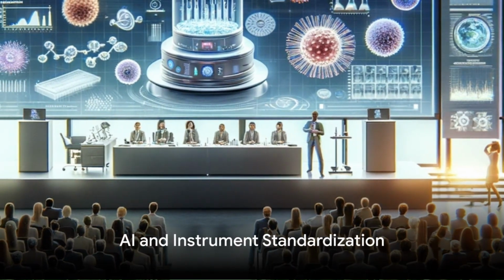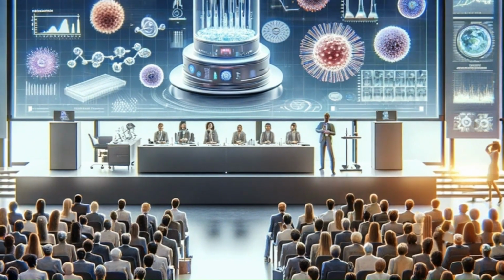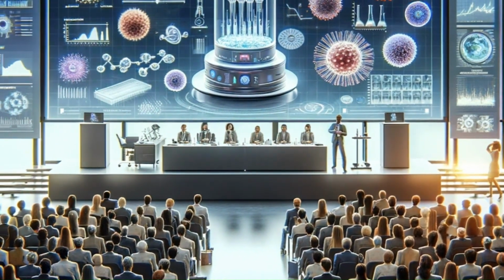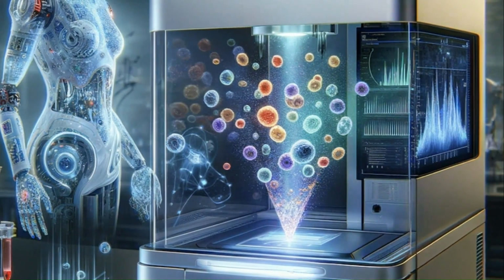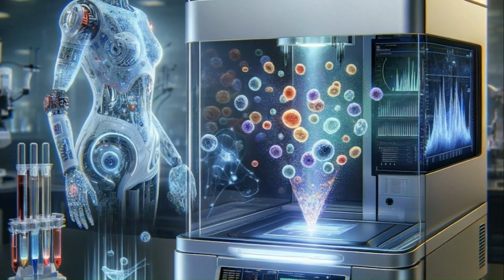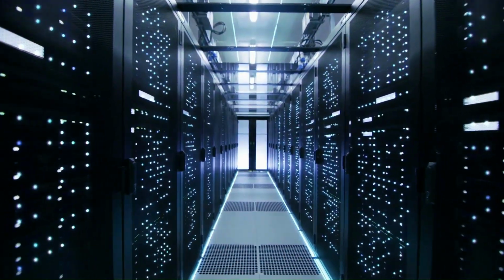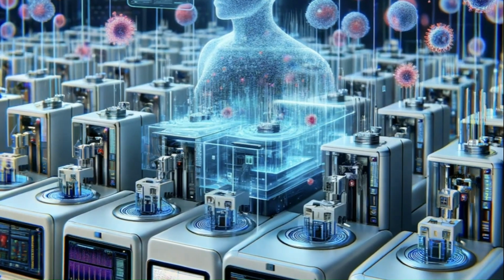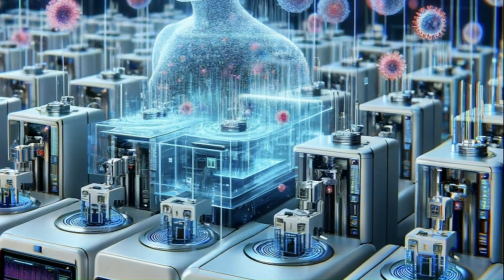Welcome innovators, scientists, and single-cell enthusiasts. Today we're going to explore the topic of instrument standardization from the perspective of artificial intelligence. AI has fantastic potential to provide and, at the same time, gain new insights from good quality single-cell data. Indeed, good AI requires good data, and lots of it. Let's dive in and think about how instrument standardization can help generate higher data quality for AI, and how AI can be used to support this process.